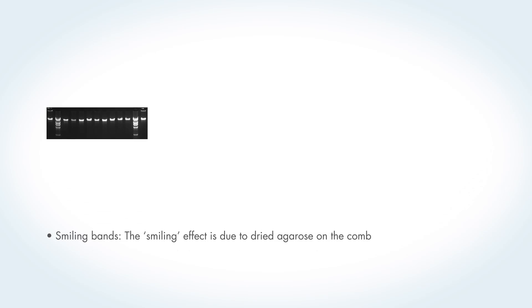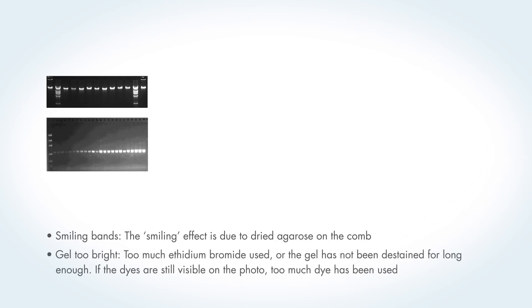Now let's take a look at some other common effects in electrophoresis and their causes. If bands have an uneven appearance, the so-called smiling effect, this is due to dried agarose on the comb. If the photo of the gel appears too bright, then too much ethidium bromide has been added to the gel, or the gel has not destained for long enough.